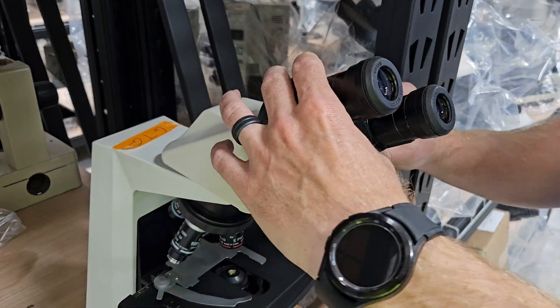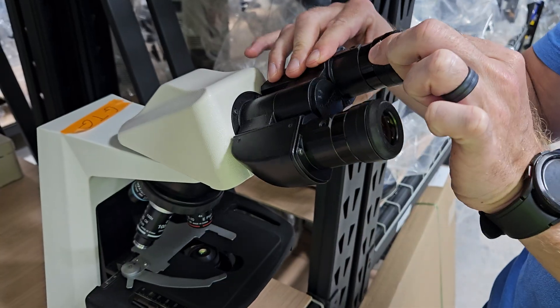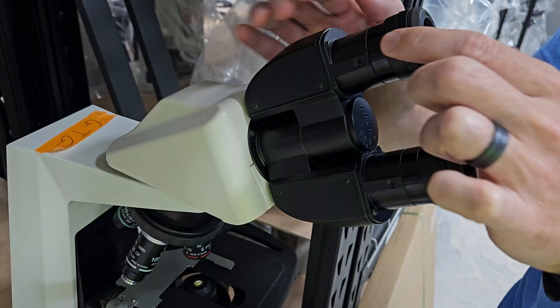These heads are pretty cool — they tilt around. What you're looking for is this eyepiece we've already loosened, but this one's tight. So if I want to take this one out, it's already loosened, but this one right here I can't get out.